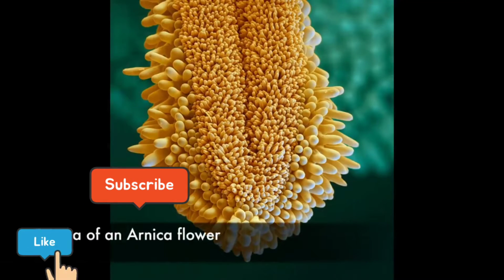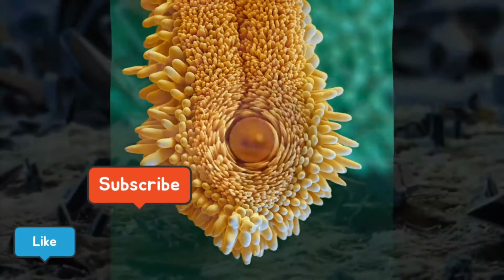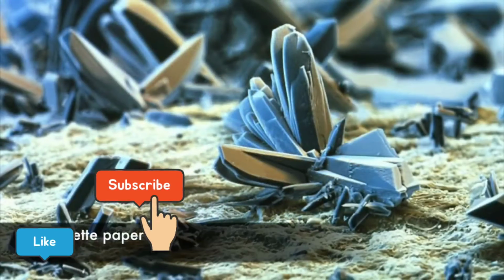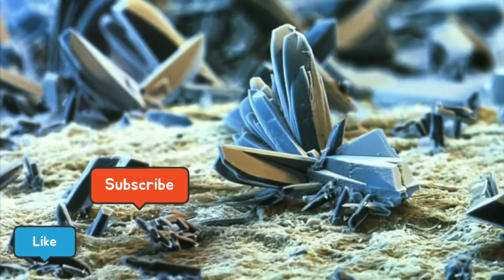The stigma of an arnica flower. This is a cigarette paper. The blue crystals are additives that keep the lit cigarette burning by producing oxygen.